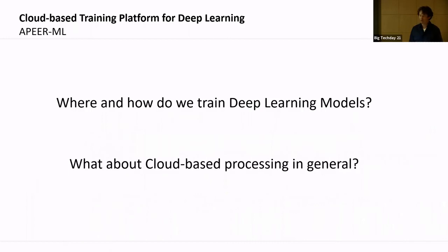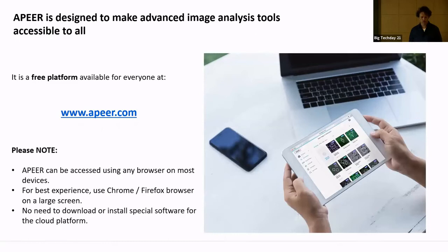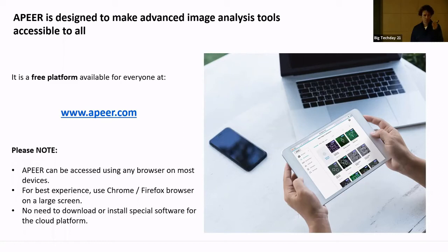How do we train models? The cloud processing platform APEER is running in your browser — you don't need to install anything locally. You just need an account, log in, upload your data, do your labeling, press the training button, and wait. You get an email when training is done, then download the network and use it for image analysis. It's free — try it out.